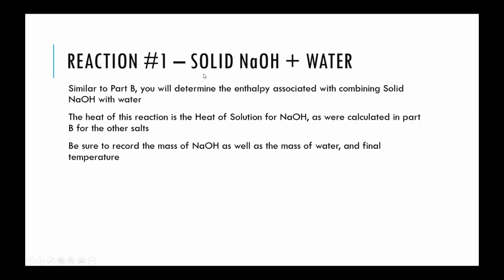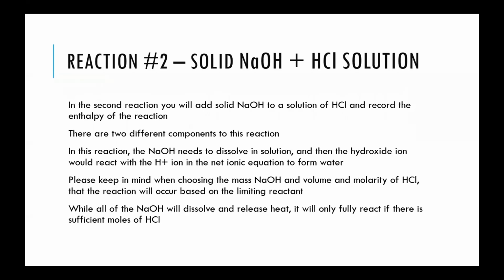In reaction number 1, this is very similar to what you did in the second part of the simulation. You're looking at dissolving solid sodium hydroxide in water and calculating the molar heat of solution for sodium hydroxide, just to take the solid and dissolve it in water.